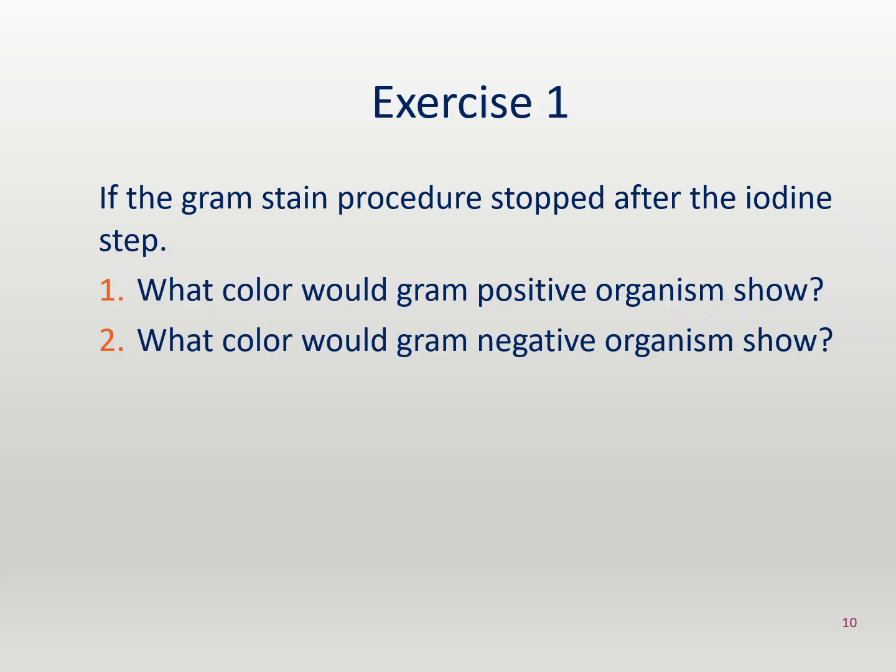Okay, exercise 1. Be prepared to talk about the gram stain procedure and what would happen after the iodine step. What would the color of the gram-positive and gram-negative organisms show?